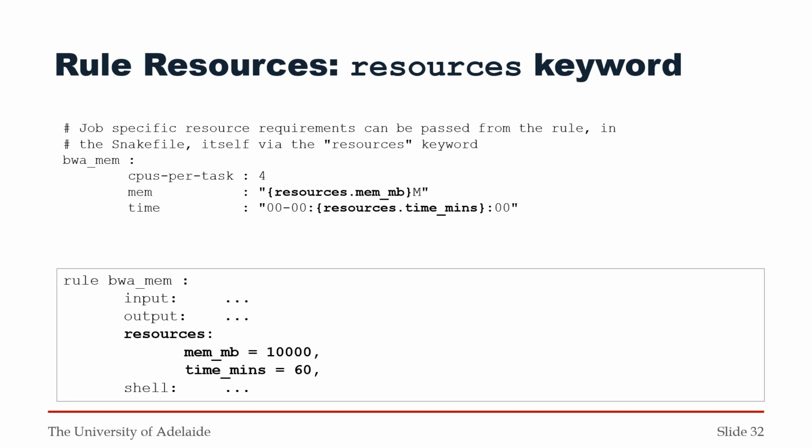And so what this allows you to do then is within the Snakefile you can use this resources keyword and specify how much memory, how much time that rule will require. So this is separating out some of the configuration from the workflow specific information, but it's still all hard coded at this point.